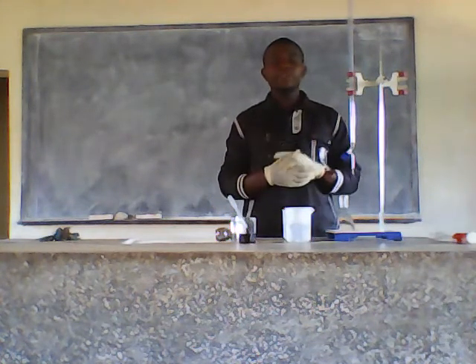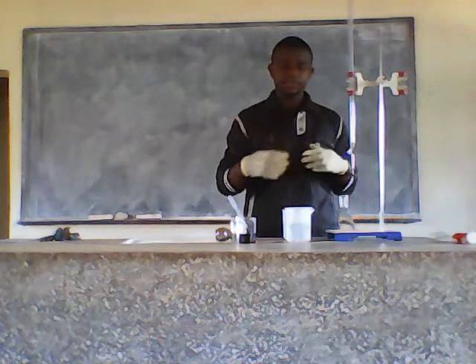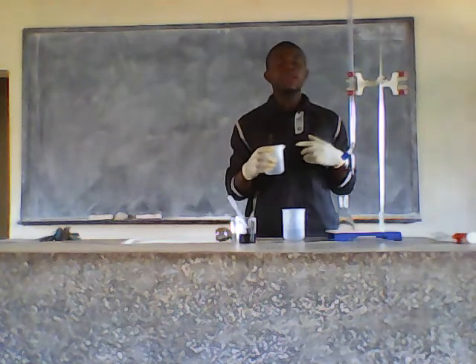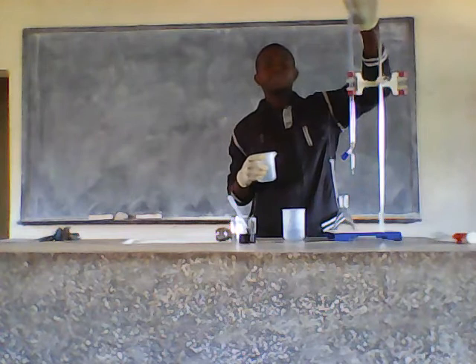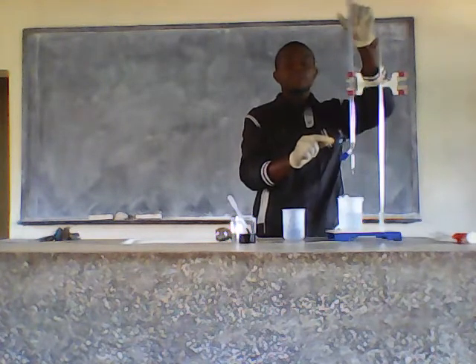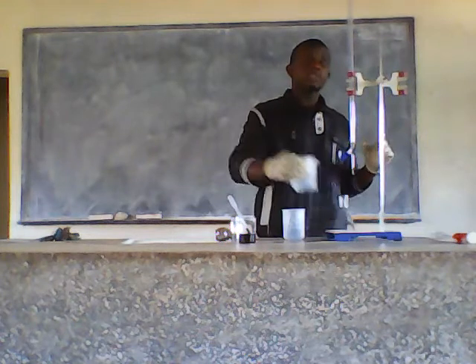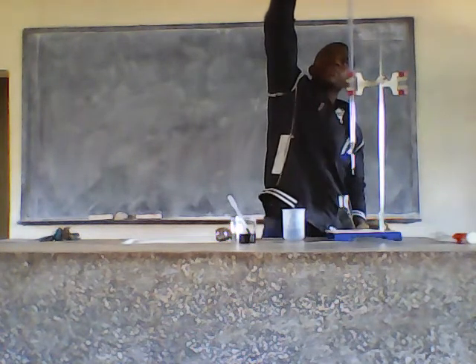Then the next step, I'm going to fill the burette with the acid. I need to fill the burette up to the zero mark. You fill the burette above the zero mark, then you put your finger here, then you open your tap, then you get to the zero mark. That's how you set your reading to zero. I'm going to fill it above the zero mark, then I'll zero my reading.